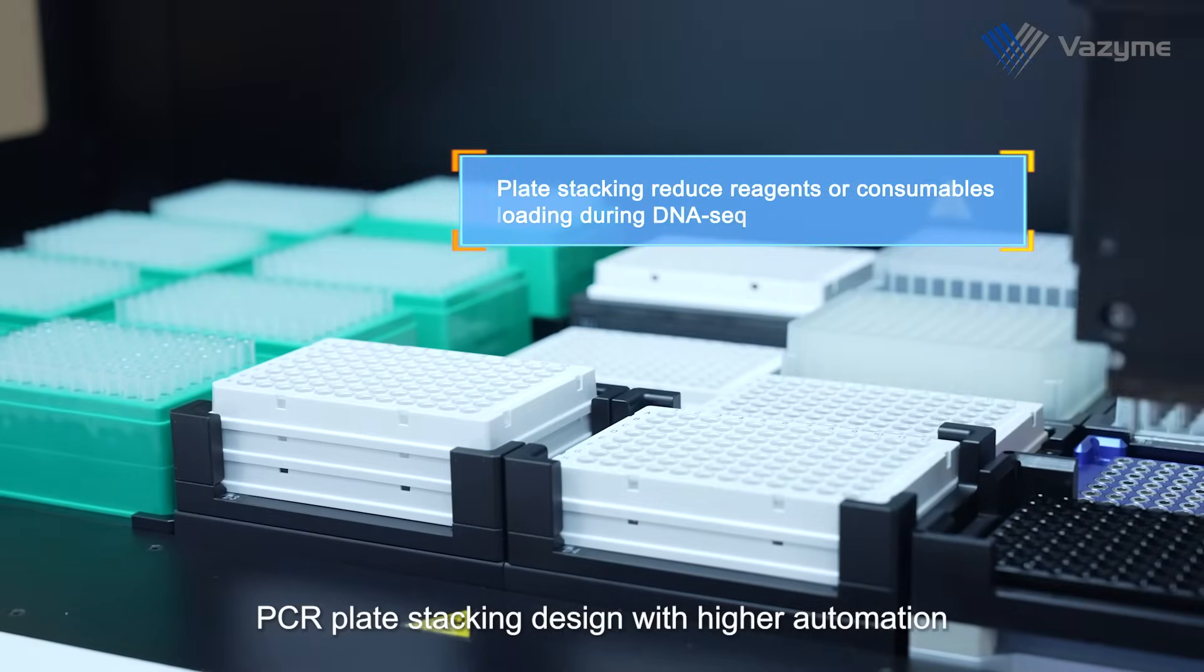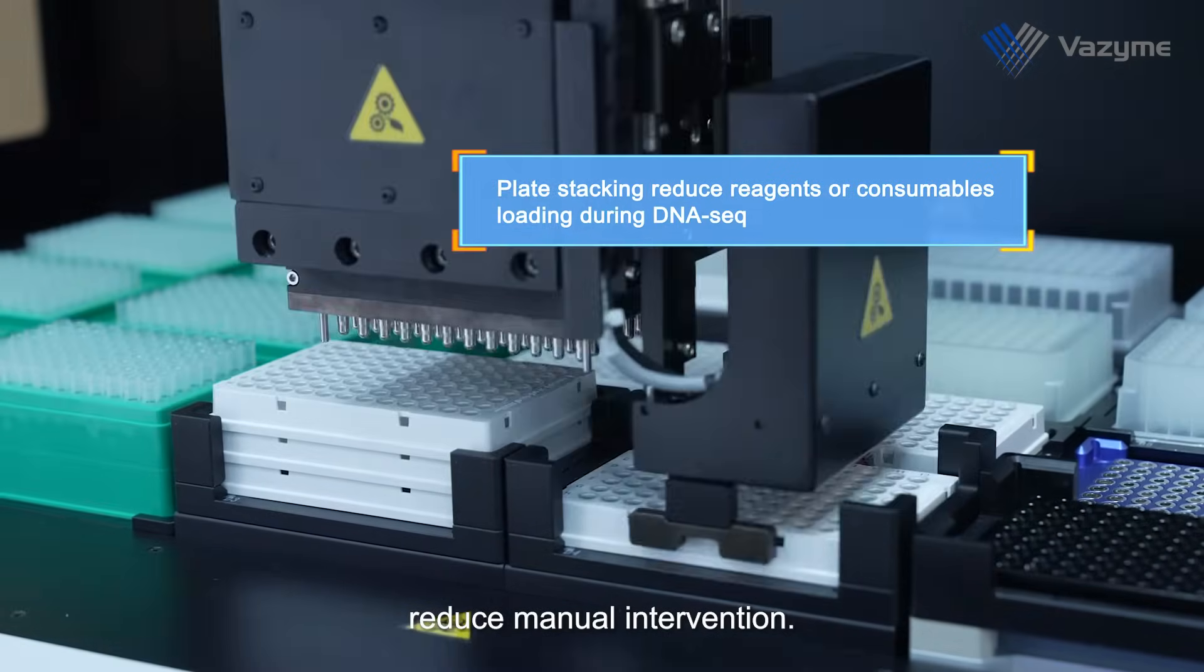PCR plate stacking design with higher automation. Reduced manual intervention.